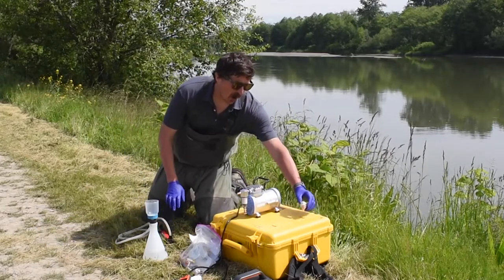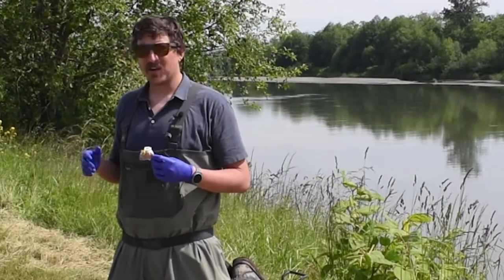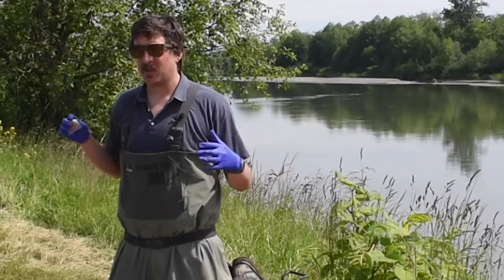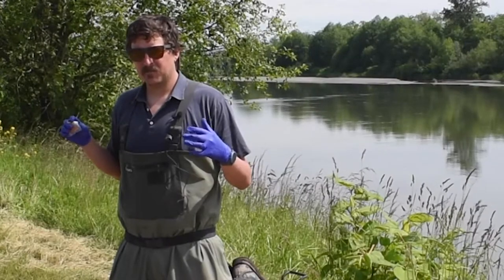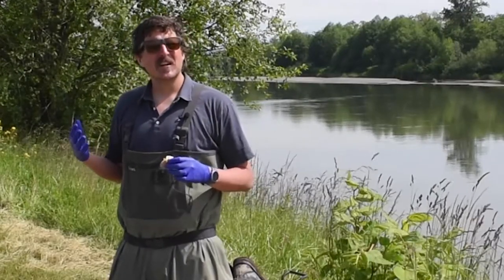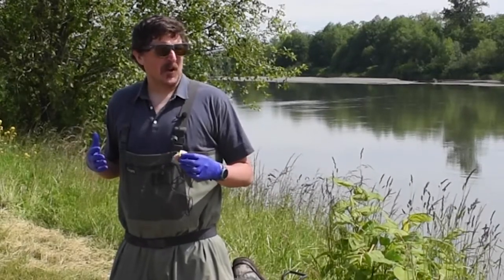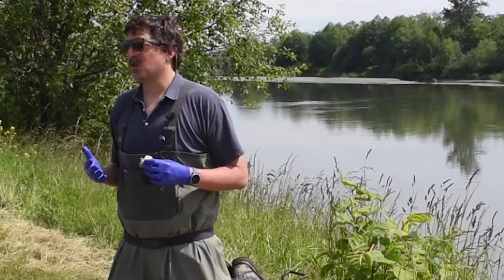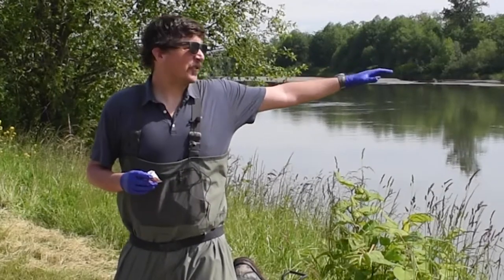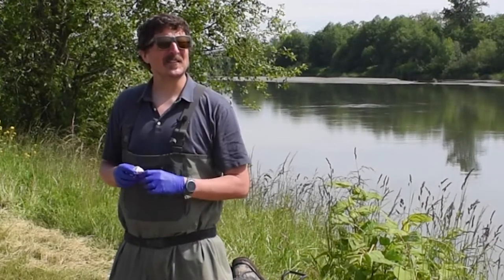Once you get back to your office, I generally put these in the freezer. When I have about 20 to 40 samples, I send them into the lab, which processes them and sends back a couple of Excel spreadsheets. There's quite a bit of QA/QC involved because of the issue of DNA concentration in each sample. There's literature with best practices for interpreting that data so you can be extremely confident that, for instance, if you're saying Chinook are in this reach, there is very little doubt that that species is in that environment.